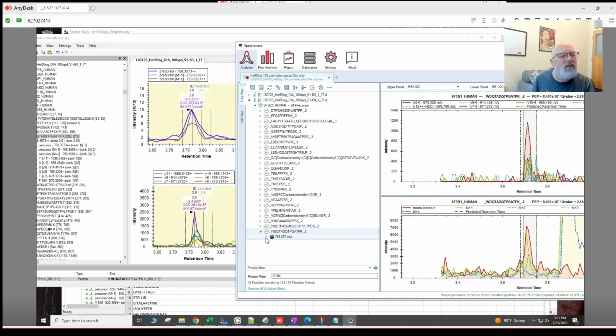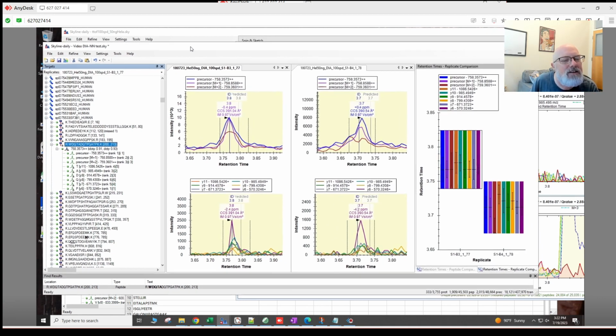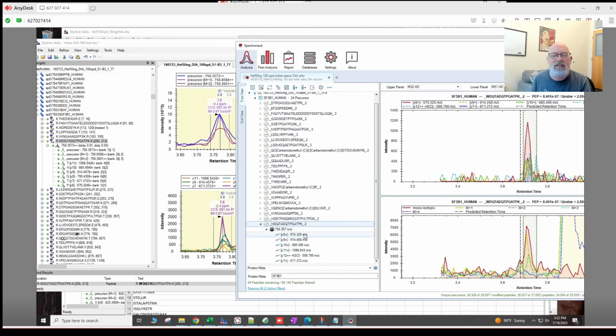Okay, so let's see. Oh, is this the same one? Let's see. 5, 7, 8, yep. Y10, 11, 7, 6. Boom. You could see Y6, 9, 10, 11, 12. Is that the same one? 11, 10, 9, 8, 7, 6.